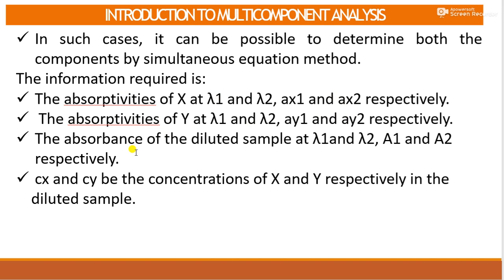Then you require the absorbance of the diluted sample. Sample means your tablet or dosage form, or solution of tablet or capsule. So, the absorbance of the diluted sample at lambda 1 and lambda 2, that is capital A1 and capital A2 respectively. If you have these values, that is Ax1, Ax2, Ay1, Ay2, capital A1 and capital A2, you can very well calculate Cx and Cy using the simultaneous equation method.